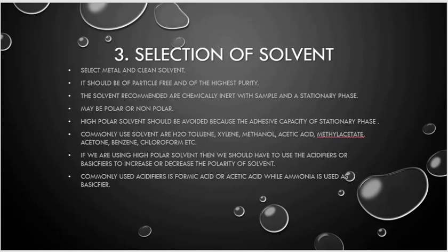Now the third step is the selection of a solvent. In this we have to select a pure and clean solvent. It should be particle free and of the highest purity, as the solvent should be particle free, having a uniform composition.